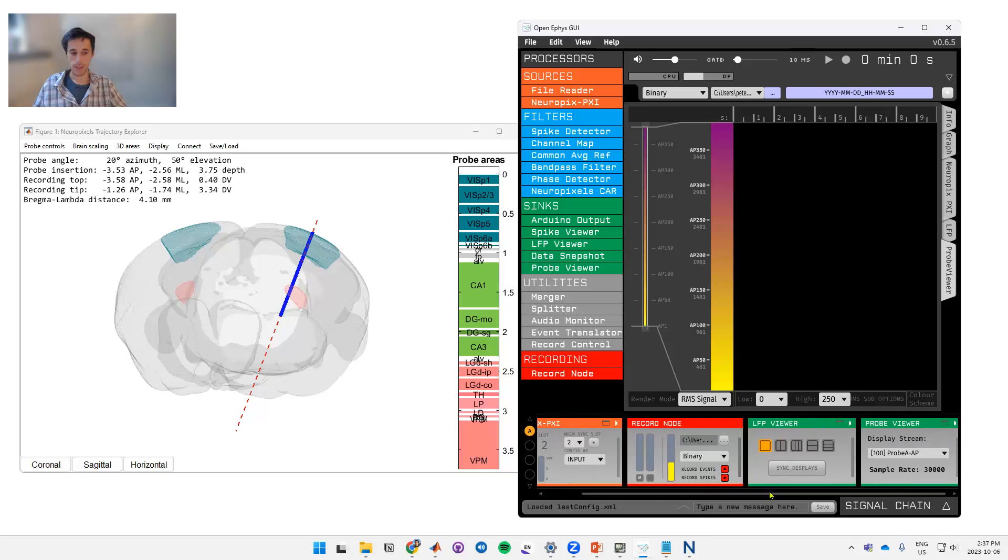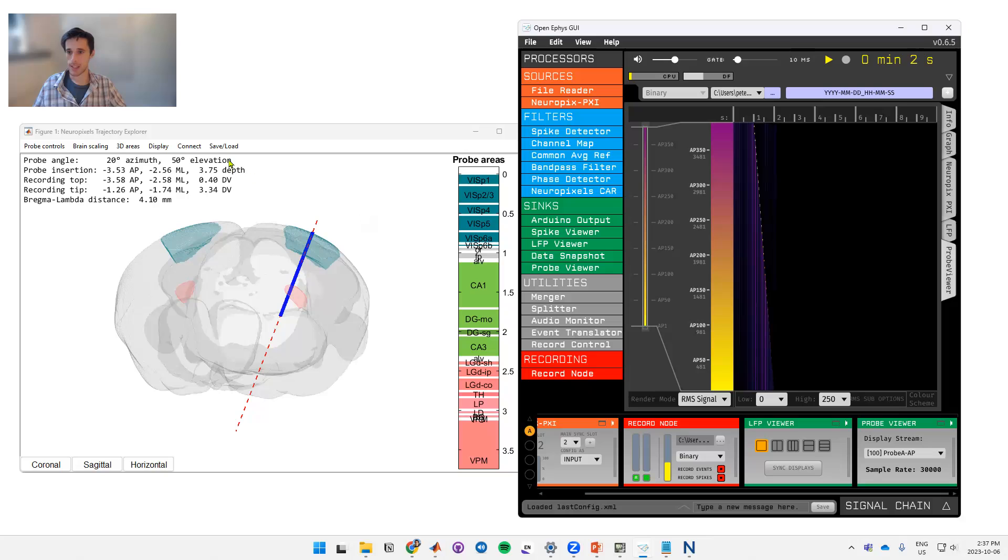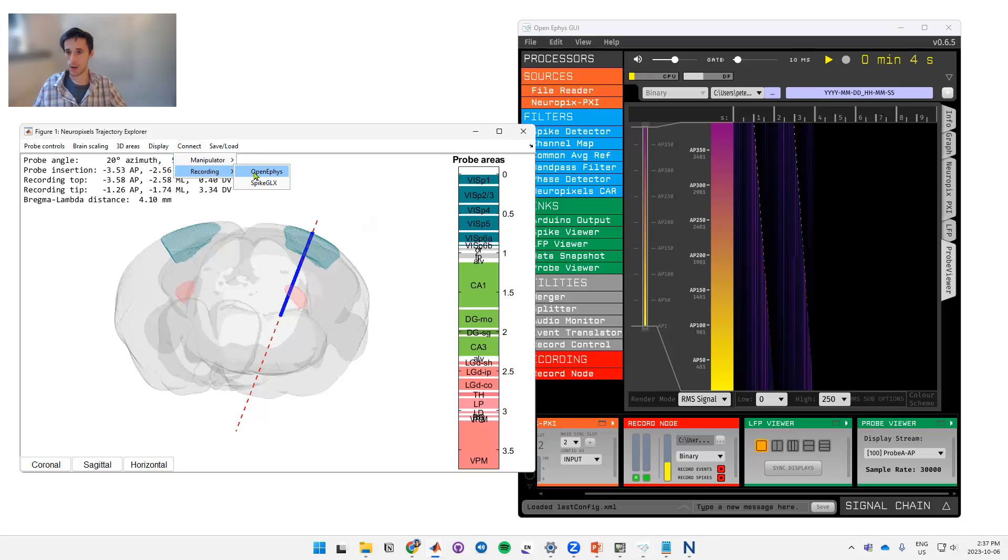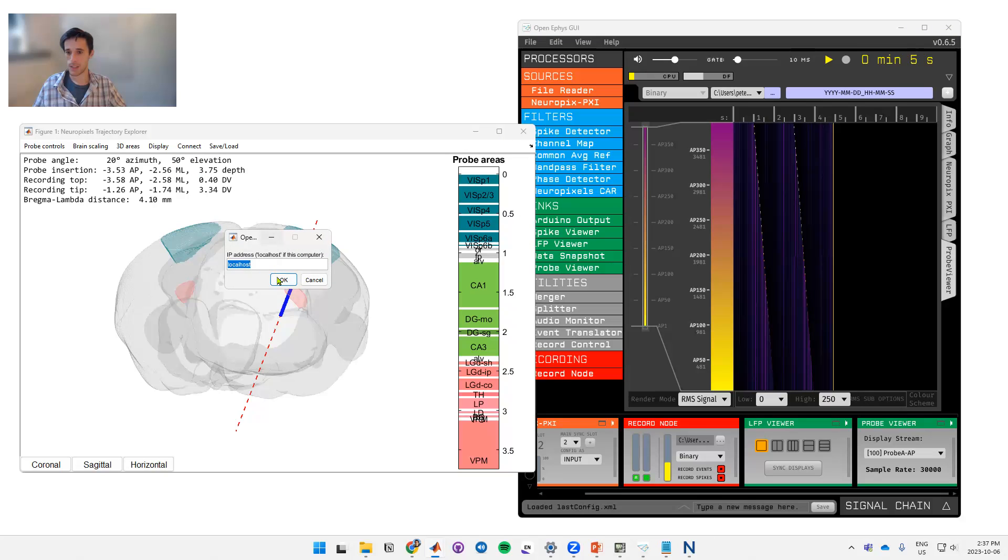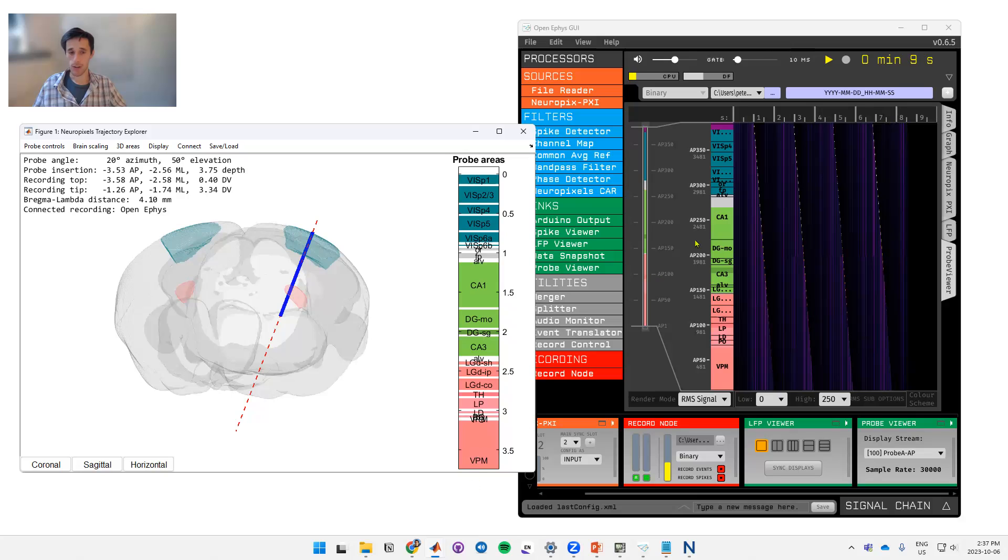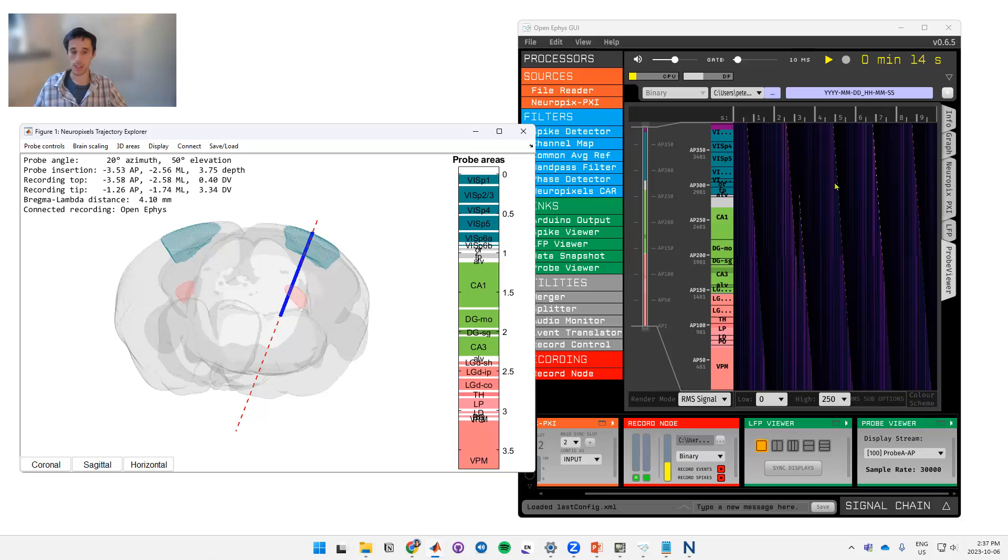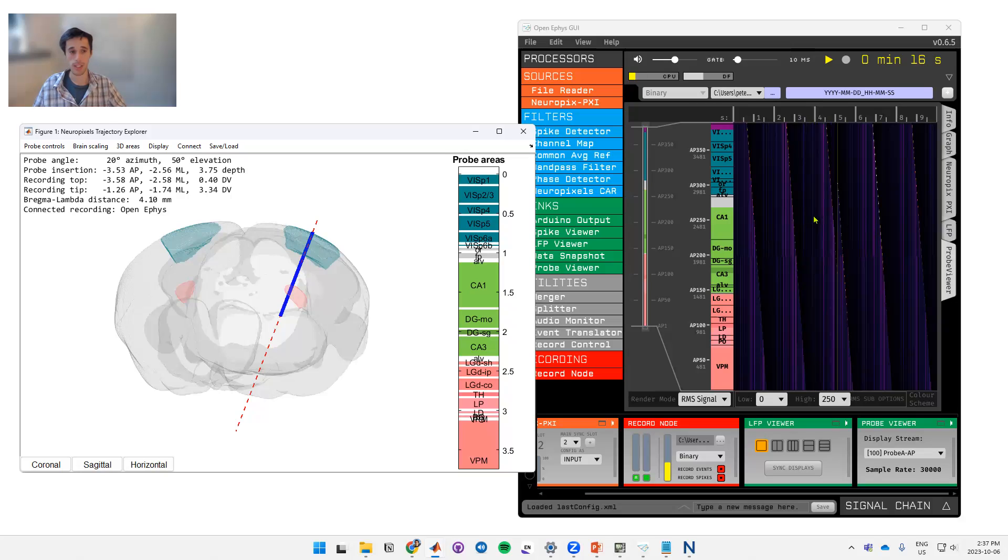So OpenEphys shows these areas through the probe viewer. Let's say I'm doing my recording, looks something like this. If I connect to OpenEphys, now the trajectory explorer is going to send these areas to probe viewer so that you can see where you are and compare that to the responses you're getting and check whether they're what's expected.